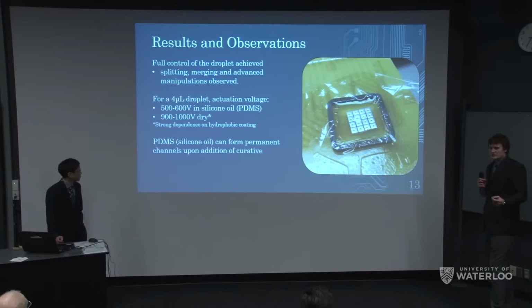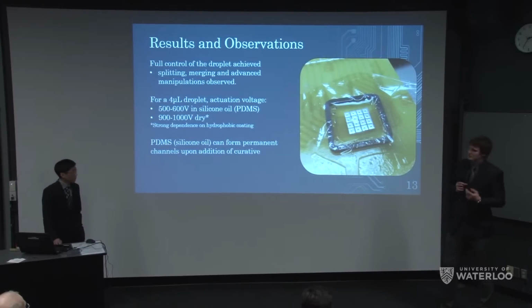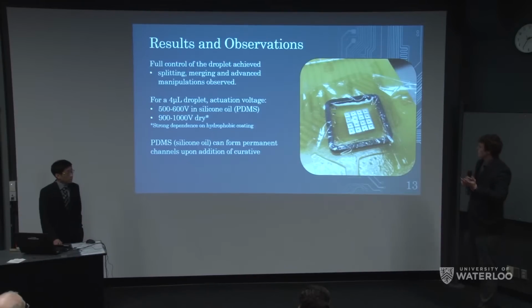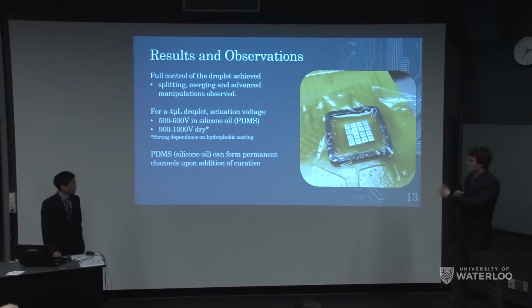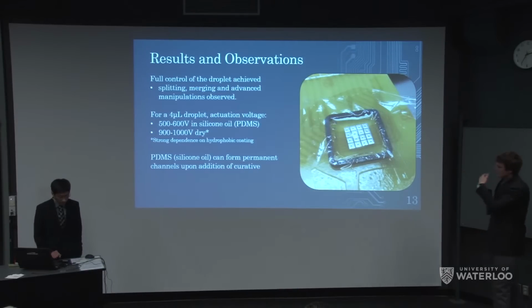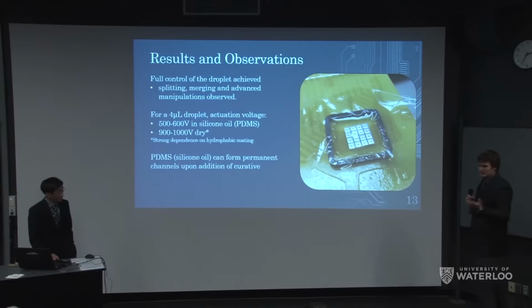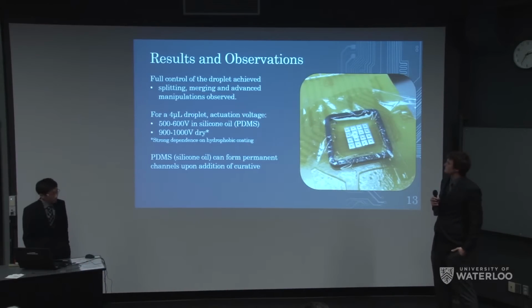And then finally, tying back to our initial applications, the oil we used here was a PDMS uncured polymer. So we could, as per our initial application, have created a channel simply by adding a curative to the material. And we did do this experiment with adding water to PDMS and then allowing it to cure, and then the water maintains its shape and then falls out afterwards.